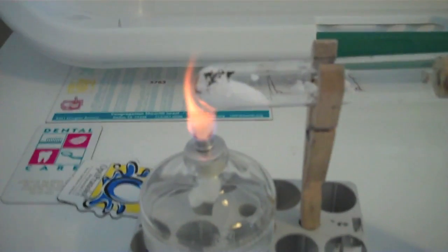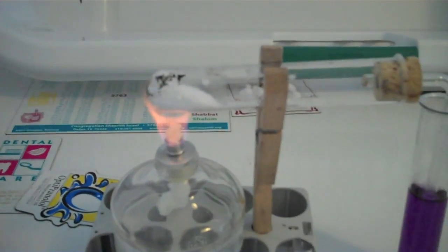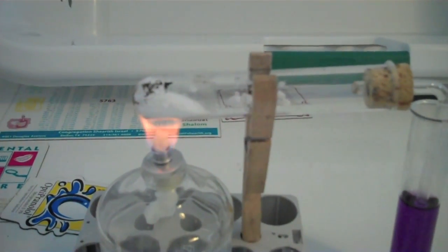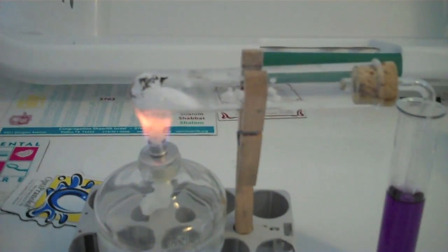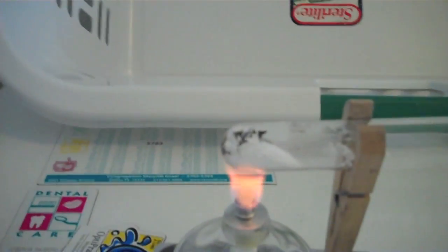So I've lit my alcohol lamp or burner, and what you want to do now is just let it sit there and heat the baking soda, the sodium hydrogen carbonate, until you see bubbles. And if you don't see bubbles it'll still produce sodium carbonate. I didn't see any bubbles but I still got sodium carbonate.